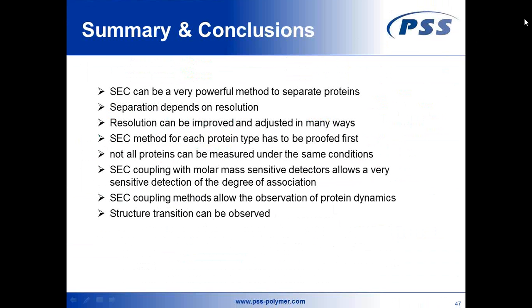The light scattering could show you an increased light scattering signal, but for a denatured sample, if it were denaturation and not aggregation, the light scattering signal would not increase, because the denatured protein still has the same mass, so you would measure the same molar mass as for the globular protein. If the molar mass is increasing, this indicates aggregation at the early elution volumes.